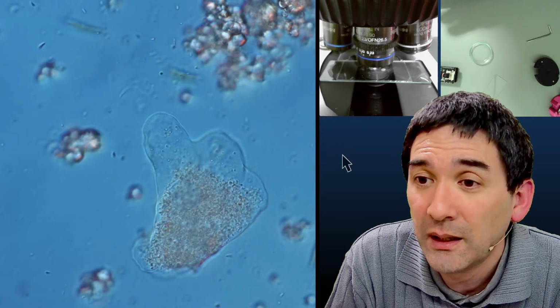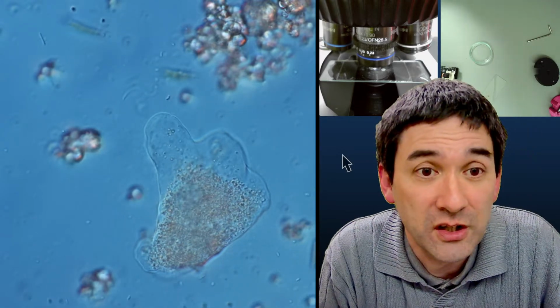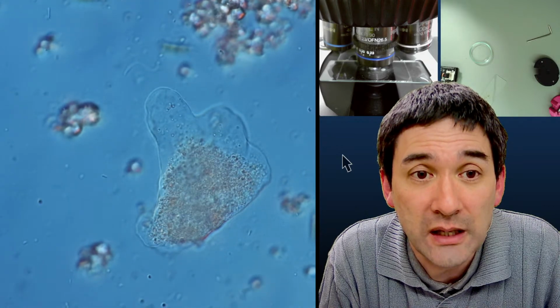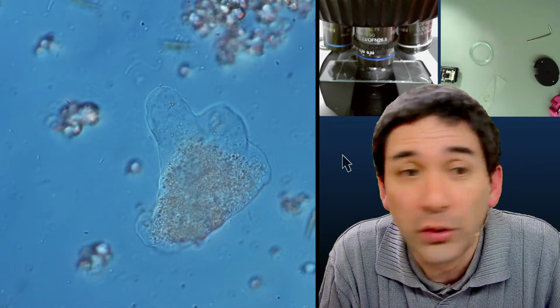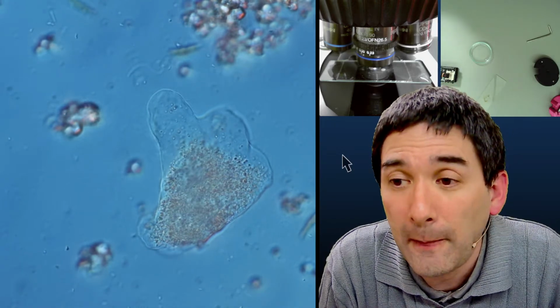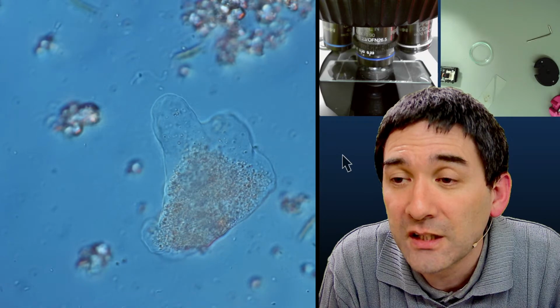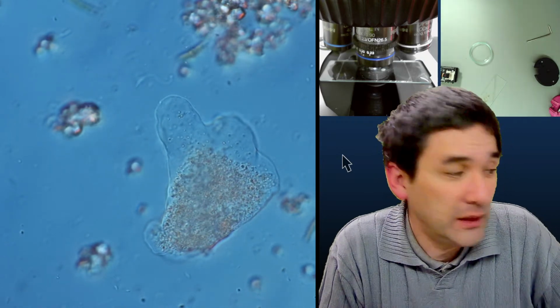Okay, the amoeba is moving, so is it an amoeba? Most likely it is, because if it's changing its shape in such a way, it's most likely an amoeba. Did anyone else see that corkscrew movement? If you're referring to the corkscrew movement of some of the bacteria, these are spirilla. They're quite common in water. Okay, spirochetes. Yep.